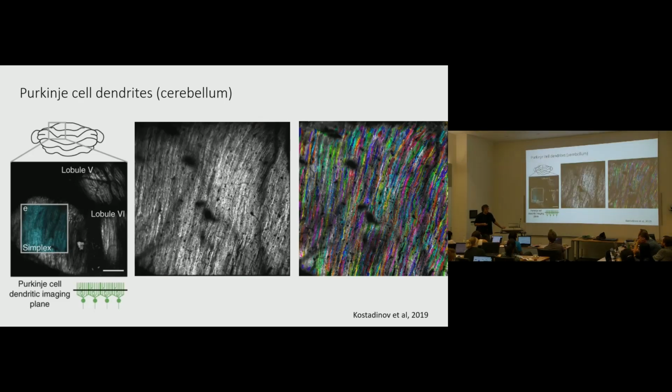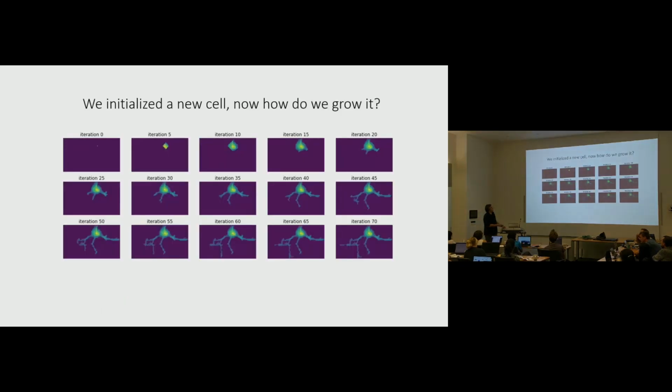Does that relate to this? Yeah, it does. There are some parameters for cleaning up these ROIs after you find them. So you find something like this, and maybe for some reason it grew across. I mean, there won't be an example here, but if some of these pixels are not quite connected to each other, they'll be clipped off. And you can turn that on or off. But I don't think it'll do much for this latest version of the algorithm that grows itself organically, because it's naturally restricted from growing over bridges.